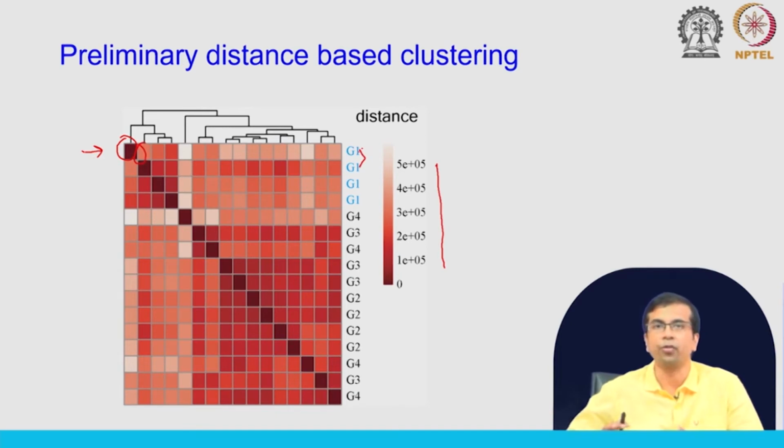That is why I am saying 4 groups, and you might ask why you see 4 G1s. It is because these are technical replicates. These technical replicates have been done for 4 groups, so 4 replicates for each group, in total 16 samples.